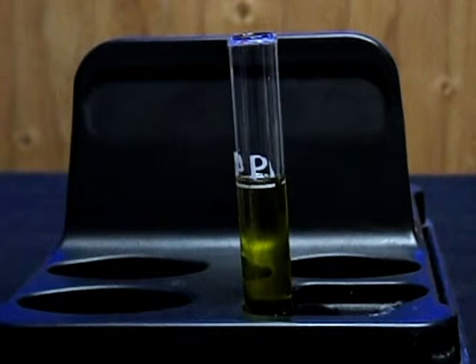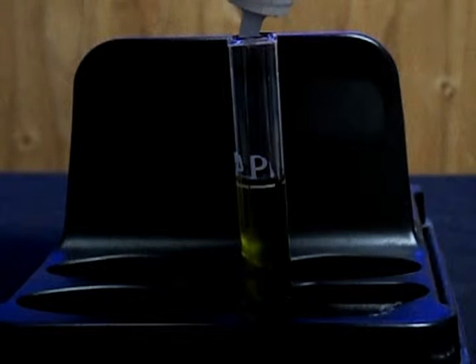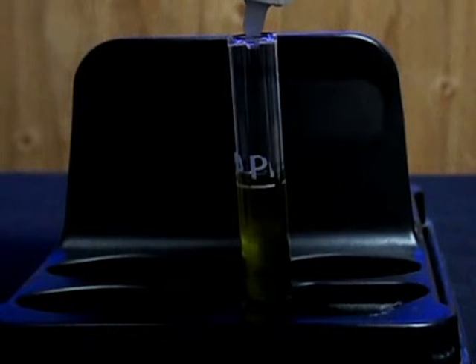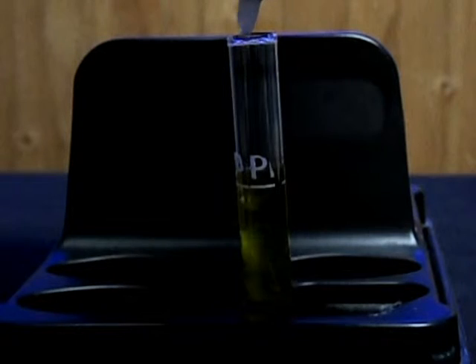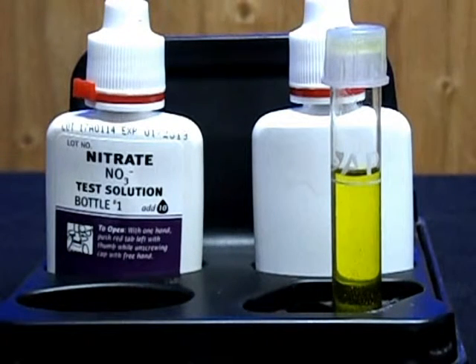Bottle number two has been shaken for 30 seconds, and now you just add ten drops to the test tube. After that you shake it for one minute. I just shook the test tube for one minute.